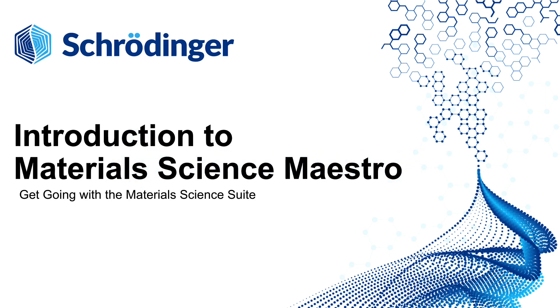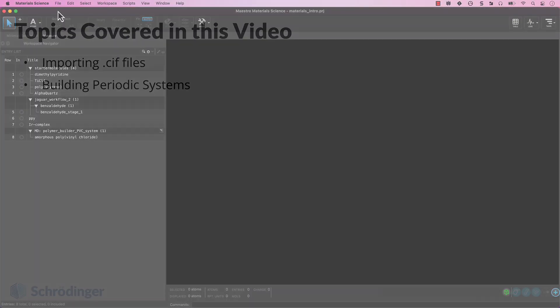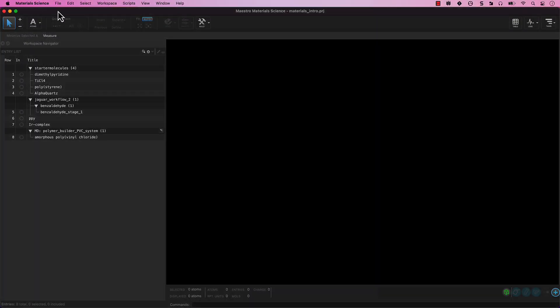Welcome back! In this video, we will learn to import a .cif file and use the Periodic Structure tools. Make sure you are back in your Materials Underscore Intro project in your Materials Underscore Intro working directory. Let's begin!